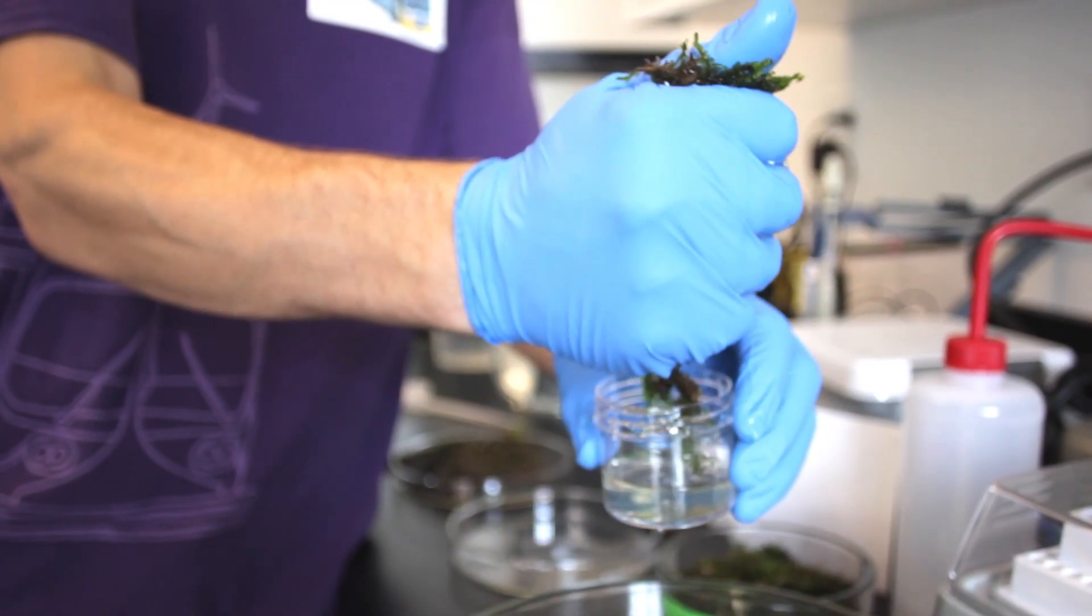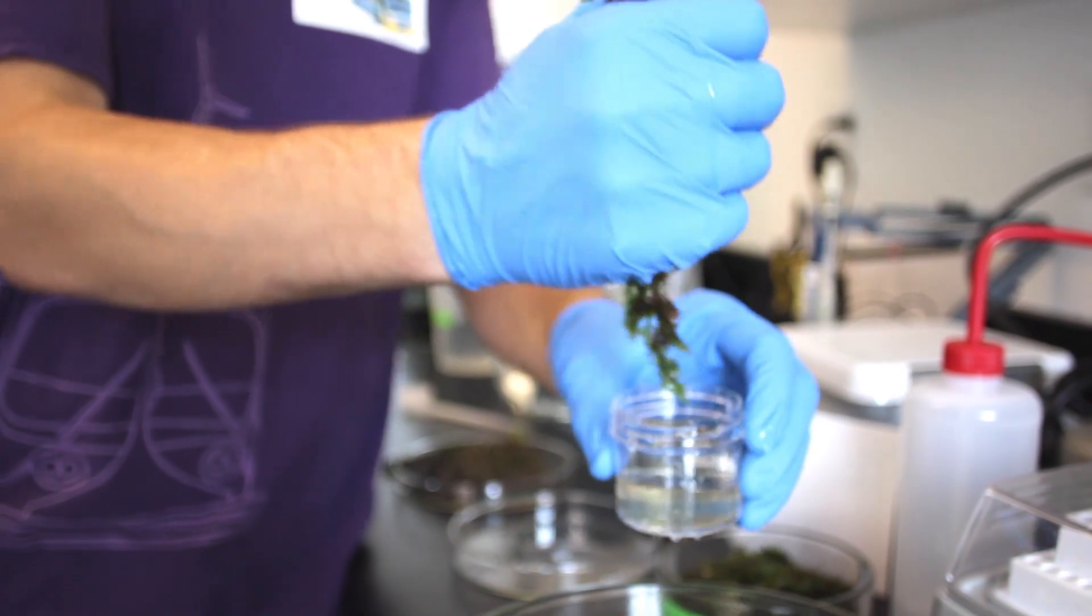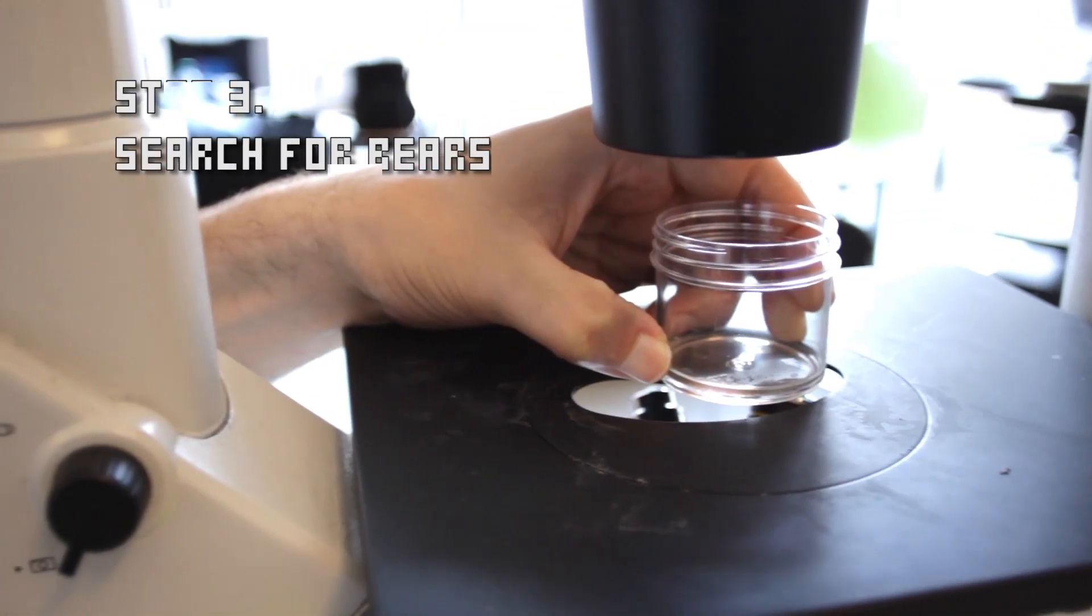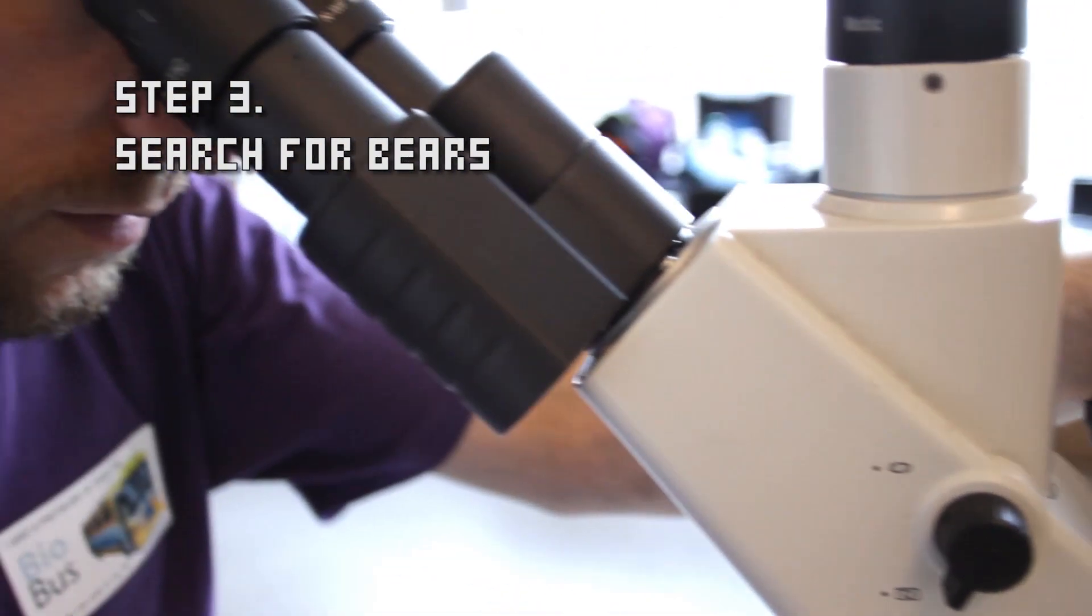So now we grab the moss and we squeeze it out into another container. If there's any water bears or other creatures in there, they'll fall out with the water. And now we're on the hunt for those water bears.